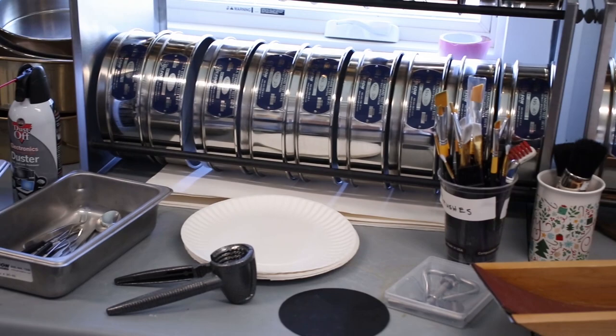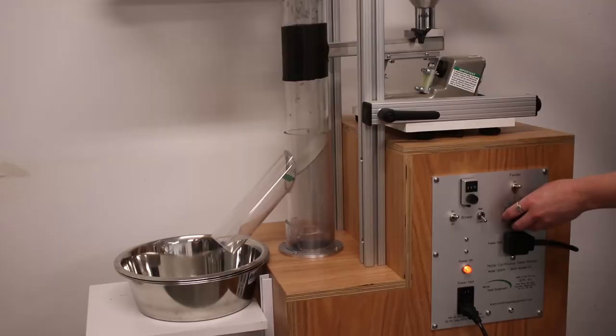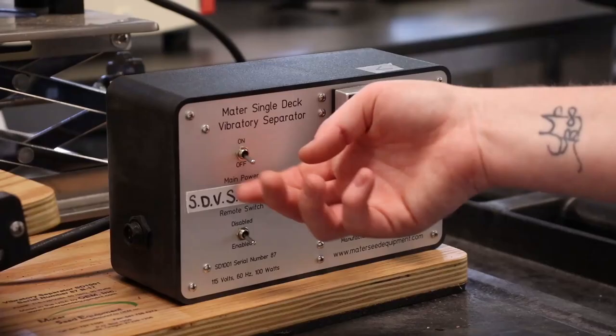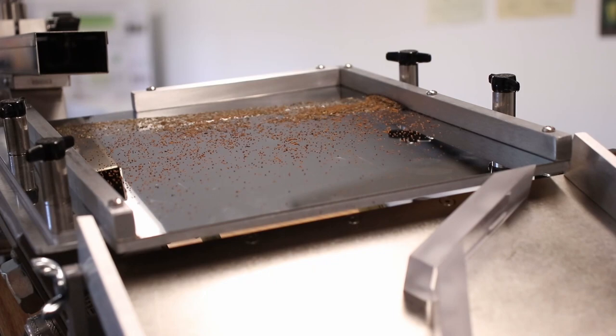Here are some of the many tools we use for cleaning seeds. This is the seed blower that uses air to separate seed from chaff. For tiny seed, we use a vibratory separator that removes small debris such as sand.